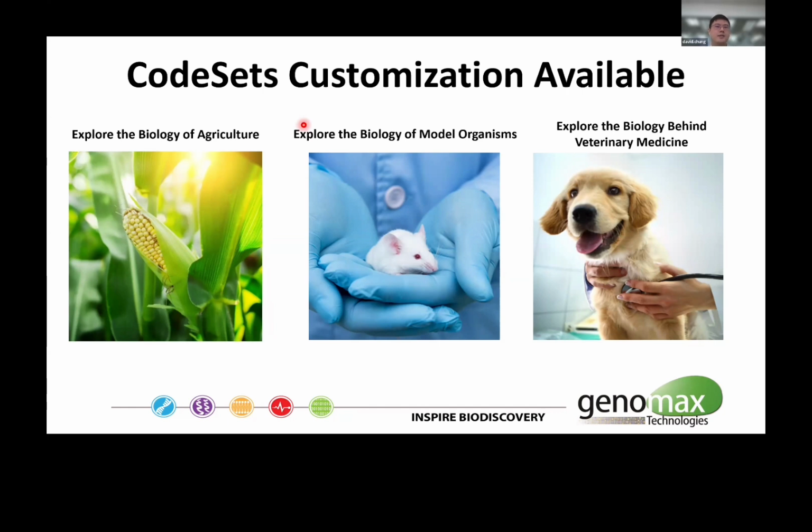Basically, what you need to do is just share the sequence or the RefSeq ID, if the sequence has already been published, and a list of target genes that you want to study with the bioinformatics team at Nanostring. Then they can help you to design the probes to specifically target the genes that you're trying to study.